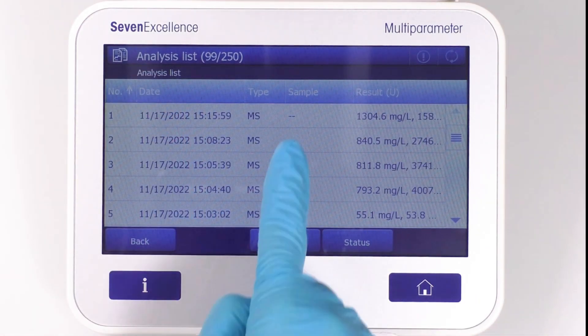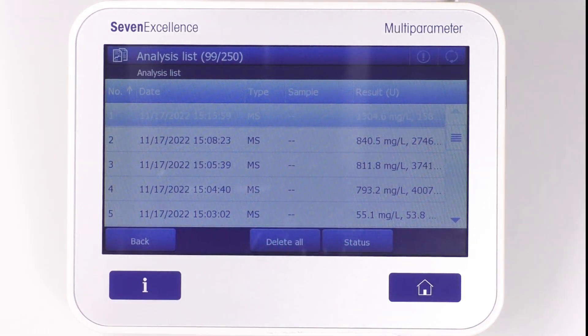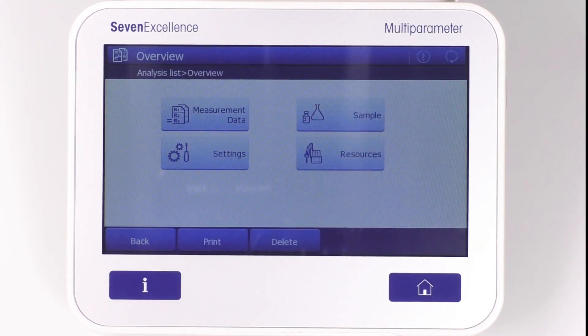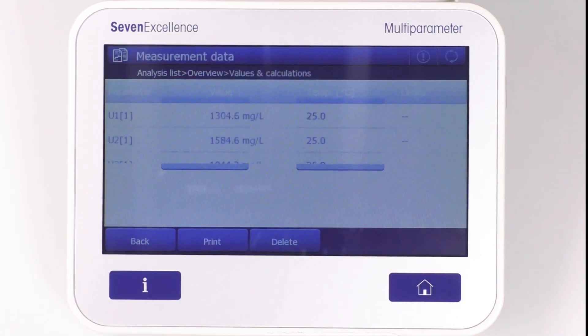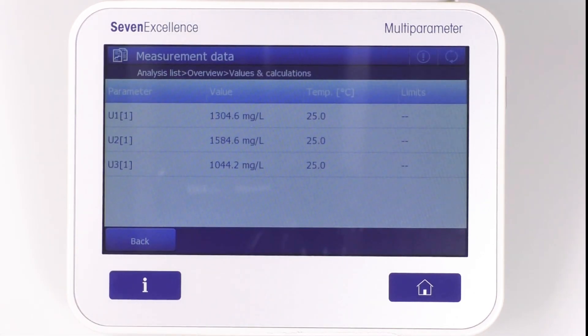When you click on a specific entry, you'll see measurement data, sample, settings, and resources. If you select Measurement Data, you'll see the final result alongside the temperature and limits.